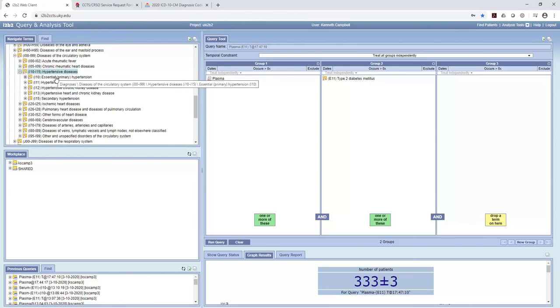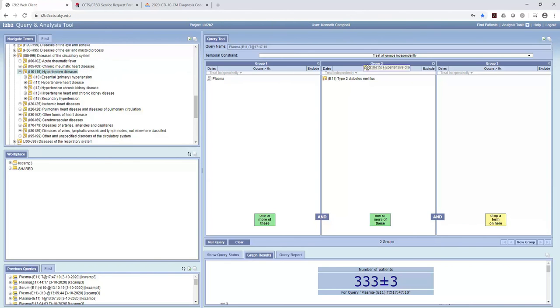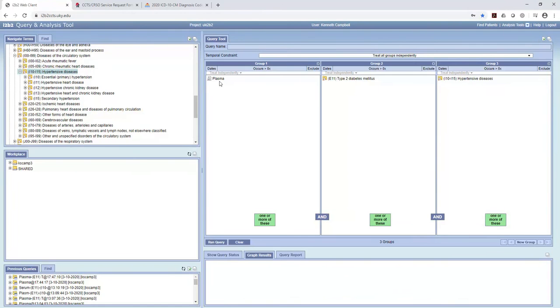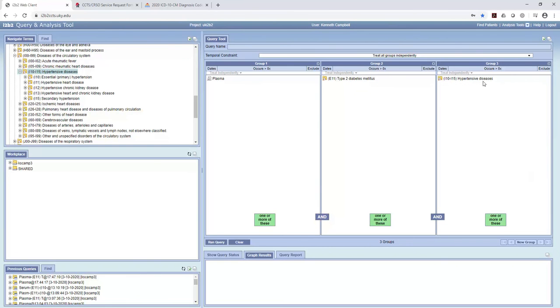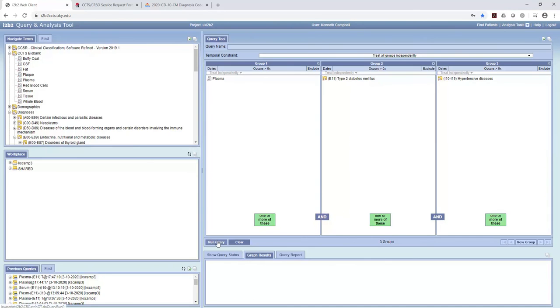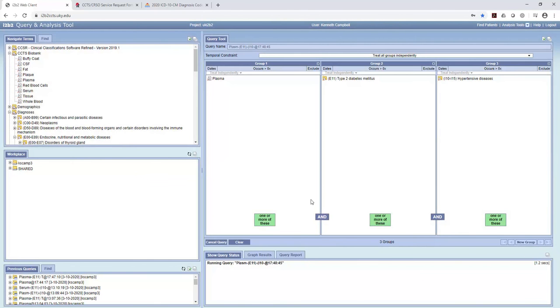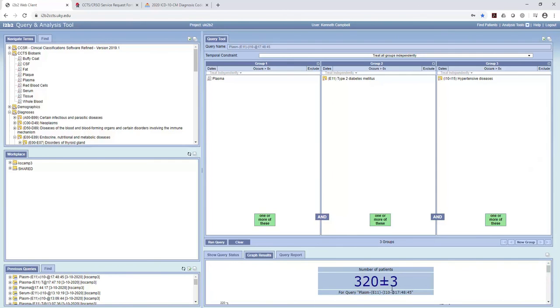And so we'll try and get that top level there. Actually, we'll just get this whole range hypertensive diseases. We'll do that one. So now we're going to be searching for people that we have plasma and type 2 diabetes mellitus and hypertensive. And just to, well, let's run that. 320. So almost the same number of patients. So probably nearly everybody who's got diabetes mellitus also has a code for hypertension.